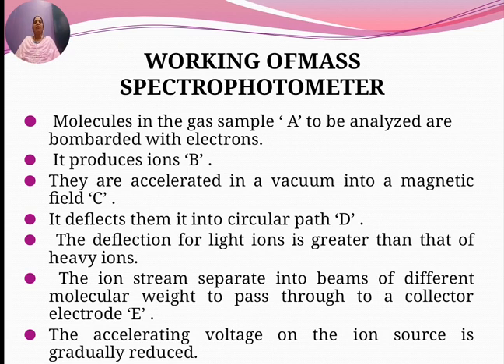So the accelerating voltage on the ion source is gradually reduced.